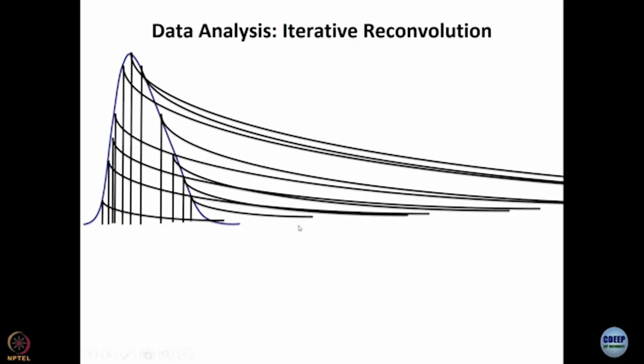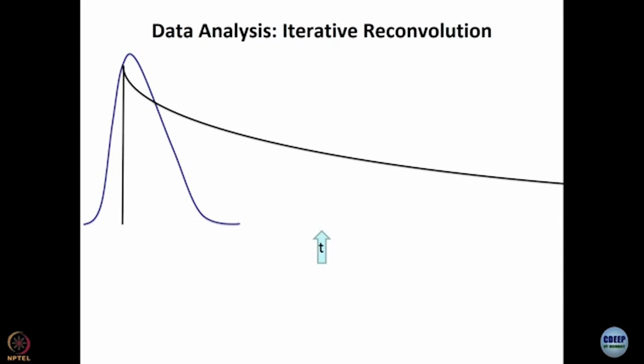If you look at any time t here, the fluorescence intensity is given by a sum of all these fluorescence intensities from all these decays at that particular time. That is the meaning of the convolution integral. Let us see if we understand it a little better now. You see this arrow, this is the time t we are talking about, and we are saying that the delta pulse occurs at time t dash. So, what is the time for which the decay has actually taken place? We are measuring at some time, absolute time t, and the delta pulse is at some time earlier, time t dash.